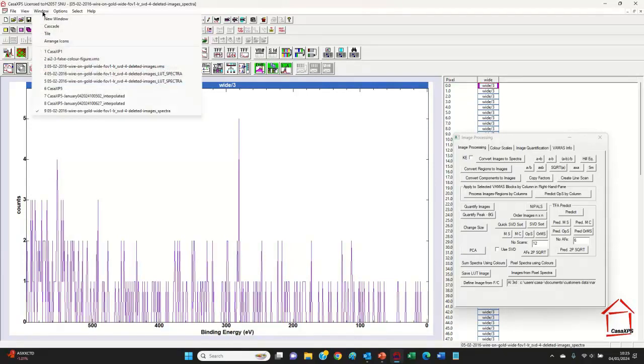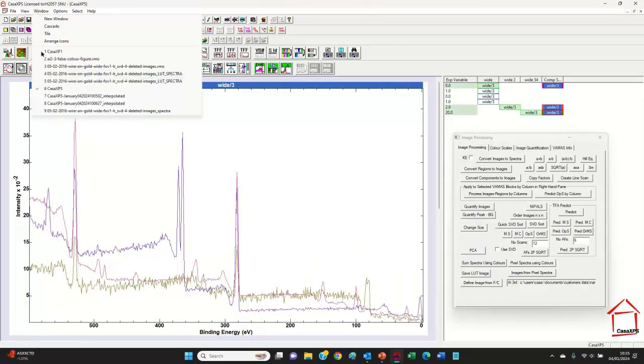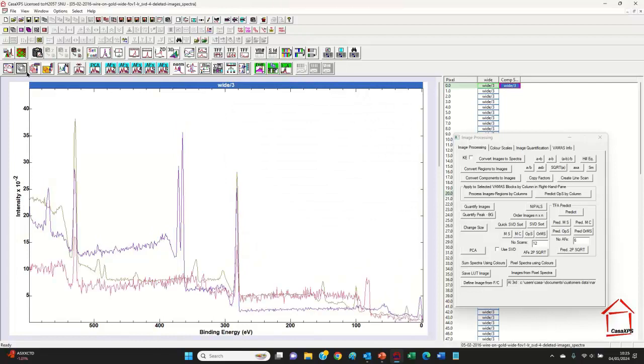So to use the analysis that has been performed here based on difference spectra and apply to these data, I need to copy the component spectra into the active tile that contains these spectra at pixels in this particular format.